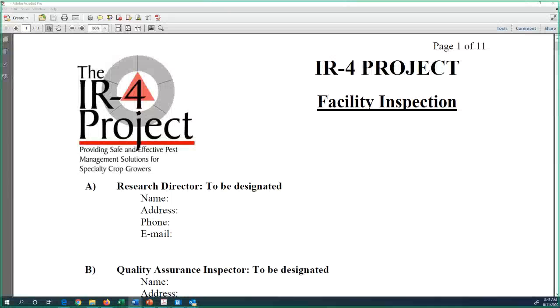Wayne also went through on this inspection checklist, I should say, reagents and solutions. A lot of times I find reagents and solutions not properly identified, with no indication of concentration or expiration, or who prepared that particular solution.